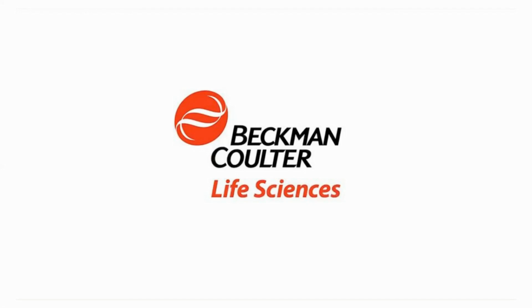And as we're converting from, say, MabSelect to Protein A, or different types of resins that we're evaluating, that would be done in a more manual, offline manner in those matrix experiments. And then once we've worked out those conditions, we update our automated systems, our automated processes, with those new conditions. And so we've had to make adjustments.